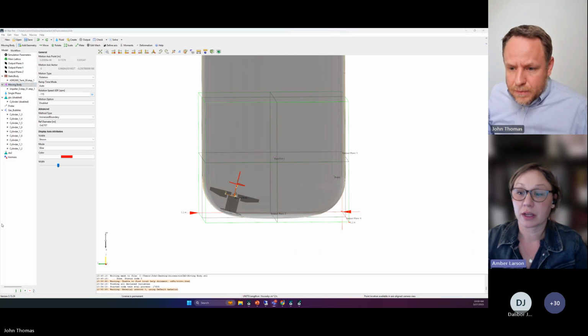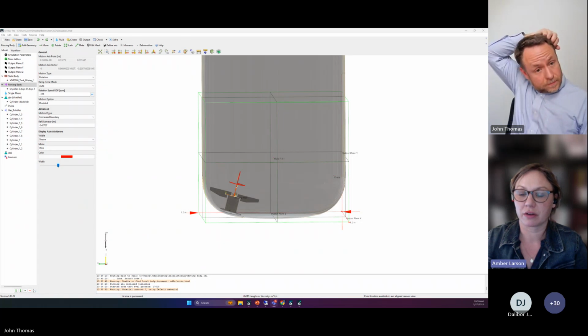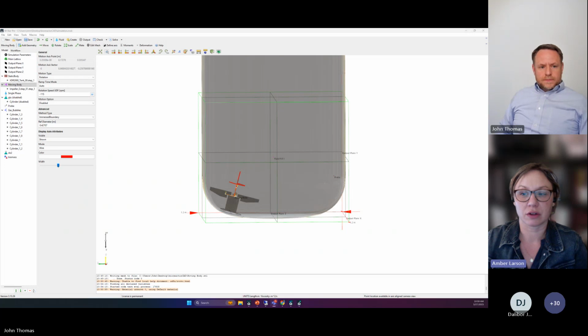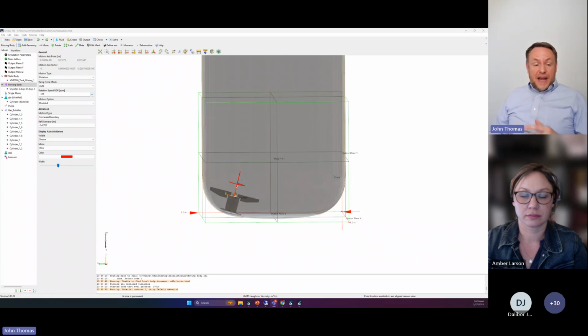Okay, one more question. Can M-Star capture the slurry flow through a microchannel, 100 micron to 500 micron? What lattice resolution will be needed to model such flow through a small gap? Yeah, so foundationally, your resolution is informed by your characteristic system size. We can do capillary flows and capillary rise, that's in the code. That's not relevant to this discussion here, but certainly, yes.